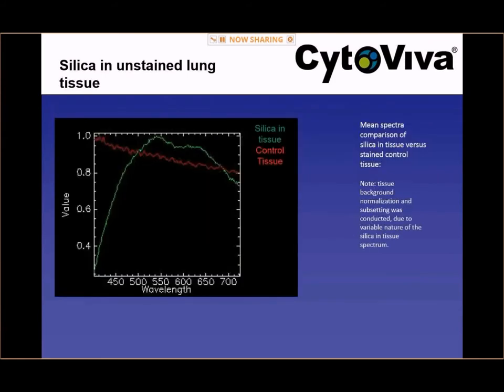The last piece of data we want to show here is the mean spectra of the silica in tissue — represented by the green curve and normalized to an intensity factor of one — demonstrated against the mean spectra of a large number of pixels of the control tissue, also normalized to one. This is a very dramatic way to illustrate the spectral response difference between the control tissue and the silica in tissue, and is very compelling data to illustrate the presence of the silica in the tissue.